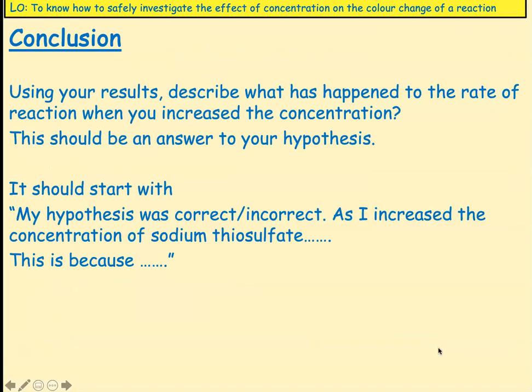Okay, from that, you should be able to now draw a valid conclusion. So using your results and graph, describe what has happened to the rate of reaction when you increase the concentration. This should be an answer to your hypothesis. So it should start with either my hypothesis was correct or my hypothesis was incorrect.